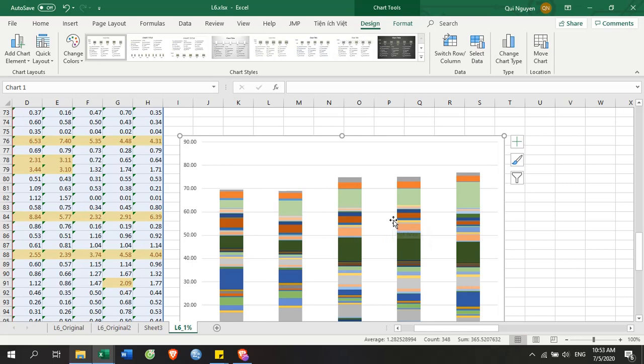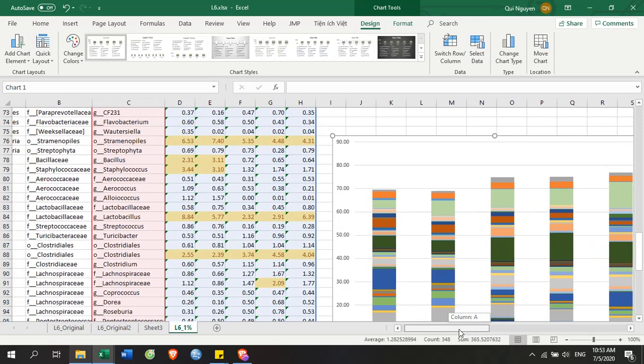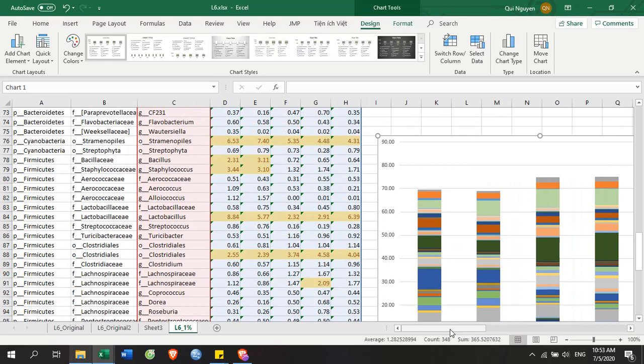When you discuss this kind of data, which level do you really focus on? Family level. In our lab, Sensei recommends the family level. But sometimes I see genus level is also interesting. We can discuss deeper, but Sensei doesn't prefer it.